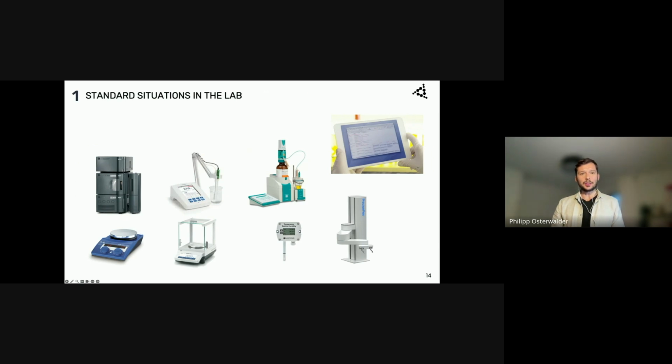Another standard situation in the lab that can cause some challenges is the heterogeneous zoo of different devices and their systems. This is kind of a big topic, because it's always necessary and also beneficial to start by integrating devices or device systems into a LIMS.